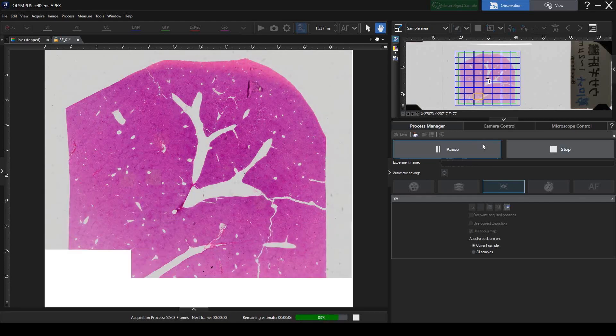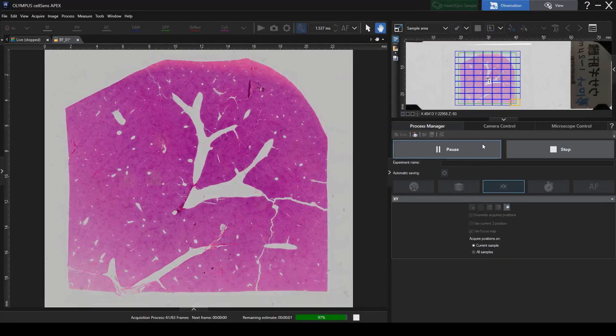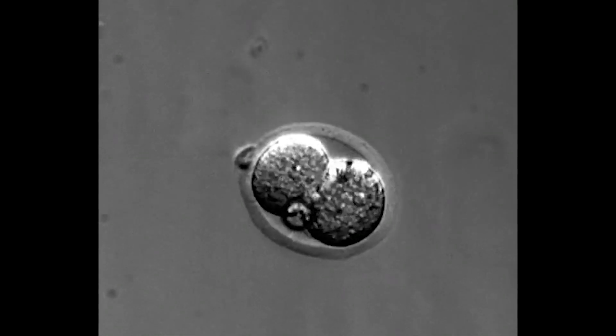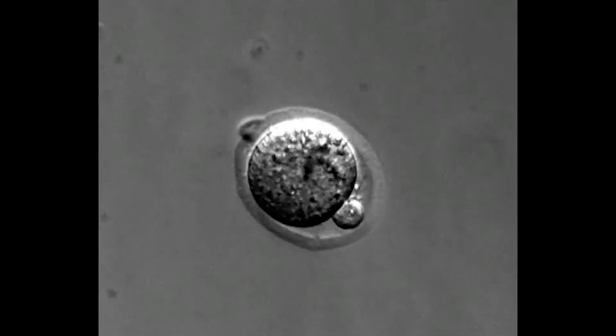Such as tiling an entire tissue specimen, or time-lapse imaging of cultured cells.